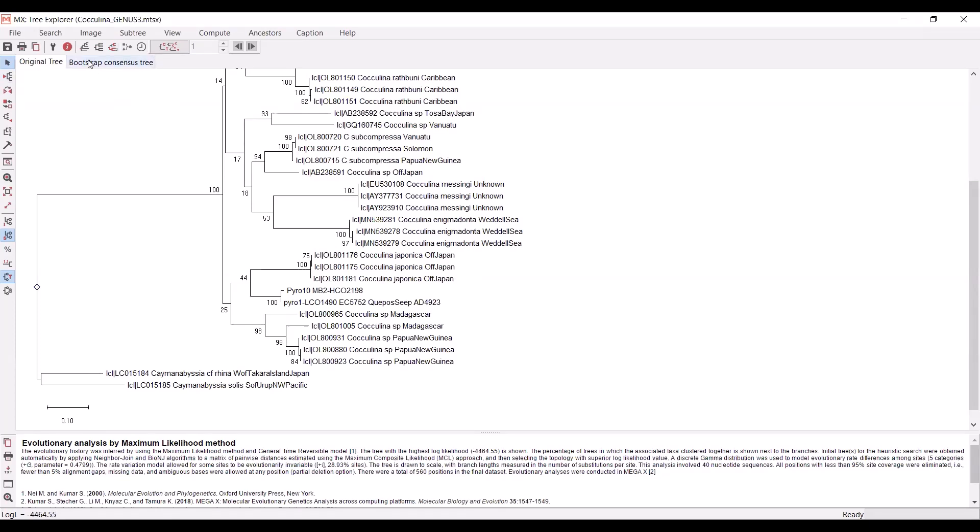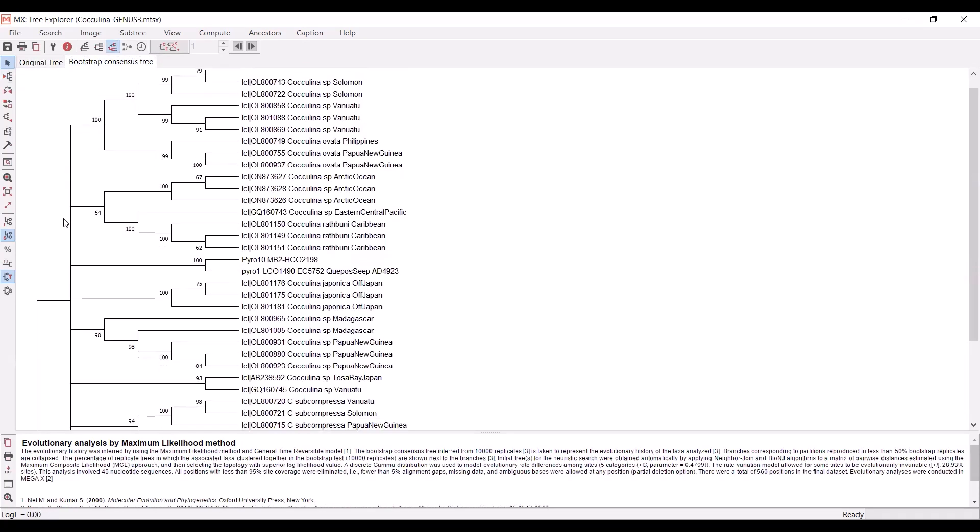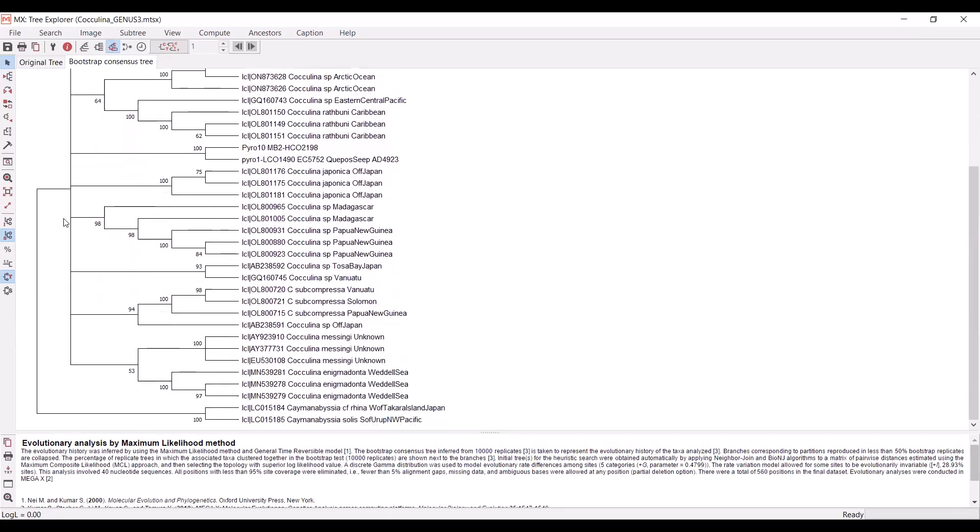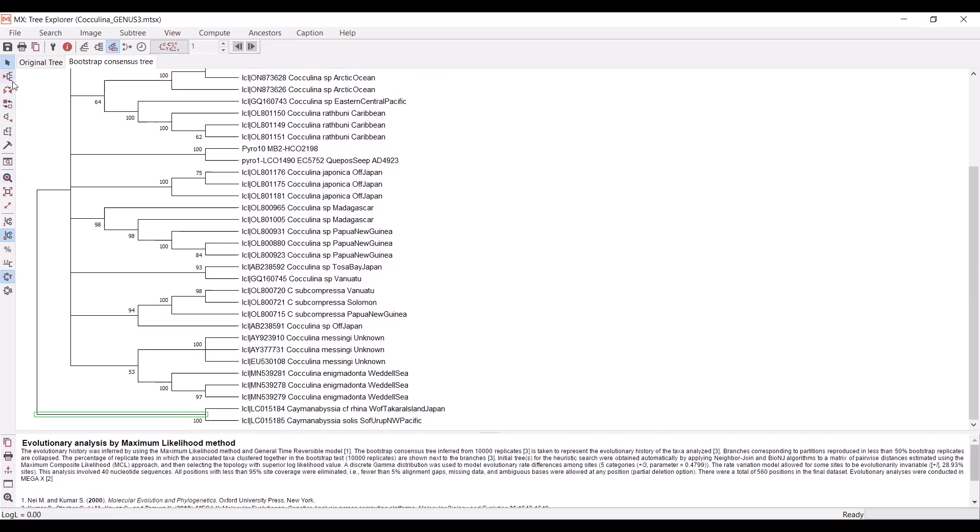You also want to do that on the bootstrap consensus tree as well. Again, it did parse the correct outgroup. But just to be sure, you can select the outgroup manually as well.